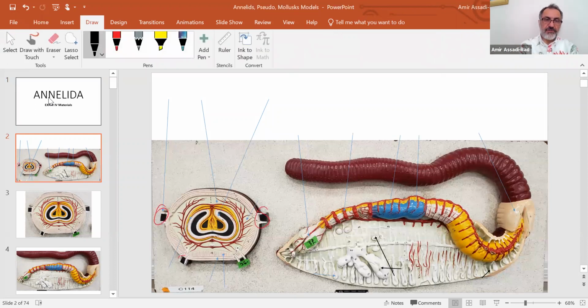These are setae, of course, 4 pair of setae. And then circular muscle, longitudinal muscle, intestine. The whole entire thing is intestine. Of course, blood vessels around it. The yellow is chloragogen cells. This is the typhlosole, and the white are epithelial cells, or the creamish color. Blood vessel, nerve cord, longitudinal muscles, coelom area, and of course, circular muscles are the thin bands, and epidermis outside.